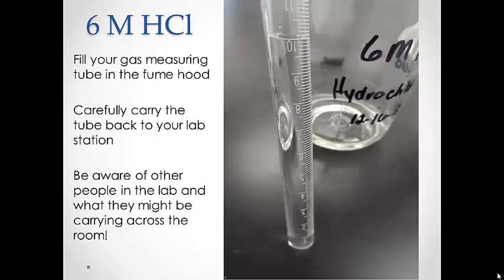In the fume hood, add about 10 milliliters of 6 molar hydrochloric acid to the gas measuring tube. It is important to be aware of what is going on around you. There are other people carrying glass and acid, so be careful when you are moving back and forth.